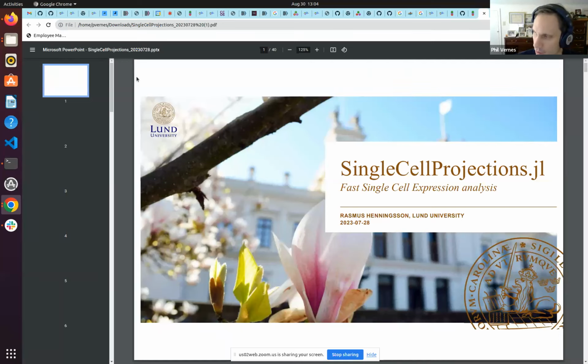In any case, the objective here is twofold. On the one hand, I want to introduce you to this package. It's a wonderful package. It's freely available. It's open source. On the other hand, I also want to illustrate some best practices when programming in Julia. I won't go too much into detail, but one of the reasons why this package works so well is that it was built with the canonical design patterns of Julia, namely generic functions and multiple dispatch.